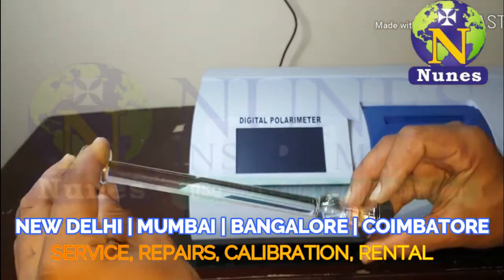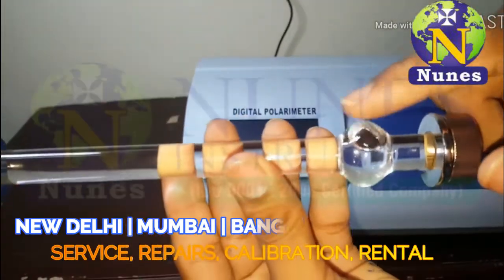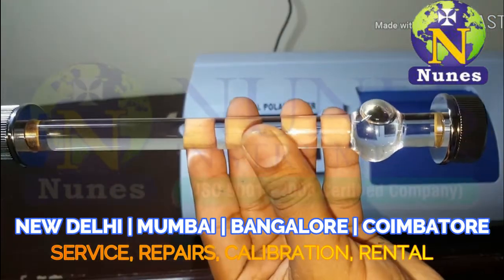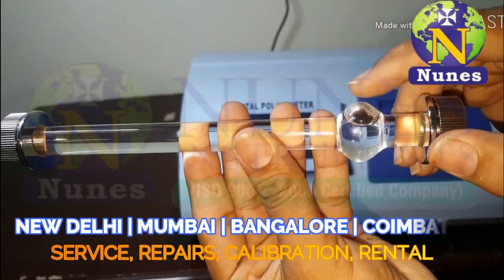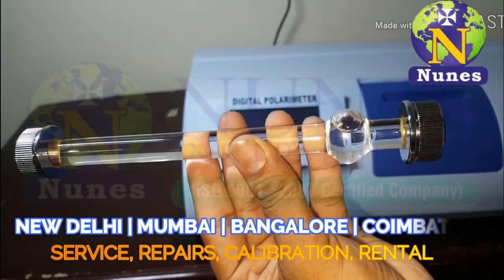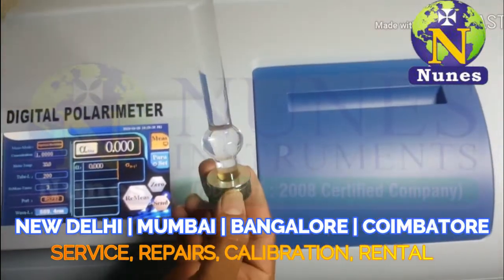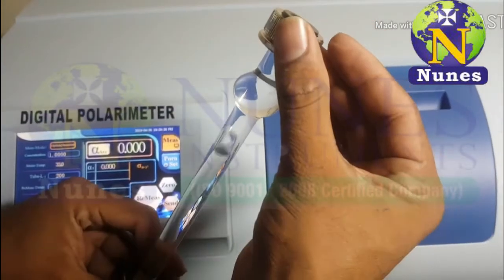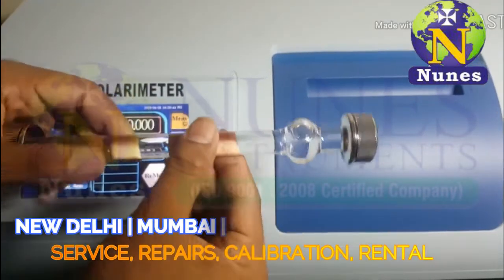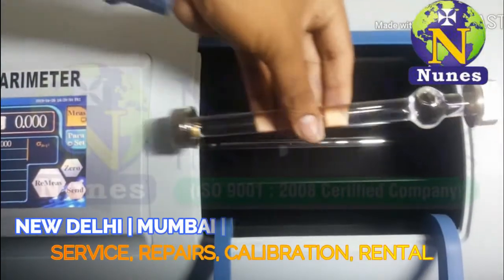Finally, keep the tube positioned so the air bubble is on the top side, because we need to remove the air bubble from the top. This is the sample air bubble position — it's very important. Now we are placing the sample in position. Again, check to remove air bubbles — keep the air bubble at the round end. This is the sample fixing position.